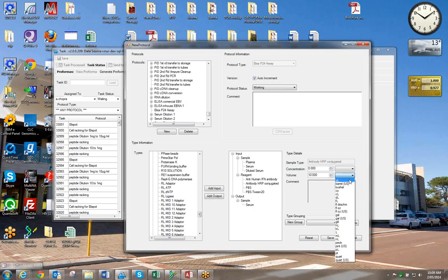And if you know the concentration of the antibody, you can put that in here. Suppose this was critical, that you put in at 50 micrograms per mil or whatever. You can put that information there. It's not compulsory to put the concentration. But if you know what you need to use, for example primers for PCRs, you say you have to use them at 25 picomole per microliter, then add it here so that people know if they want to go and look at it. PBS, again, I'm going to add 100 microliters of PBS to my sample.